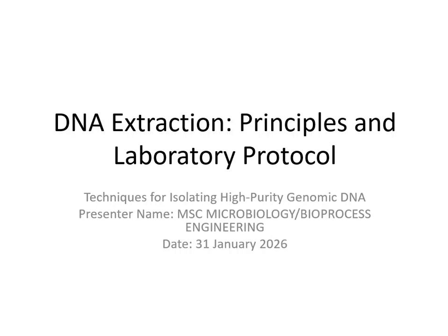Everyone, welcome to my YouTube channel, and today I am going to give you a brief process on DNA extraction, in which I will deal with the principles, laboratory protocols, and the process for isolation of high purity DNA.